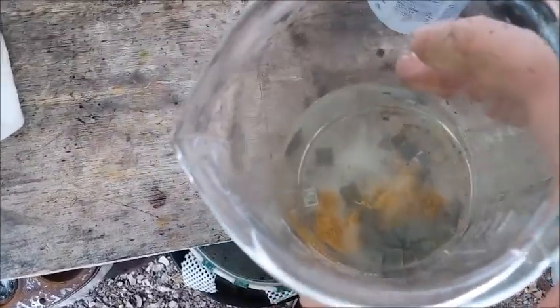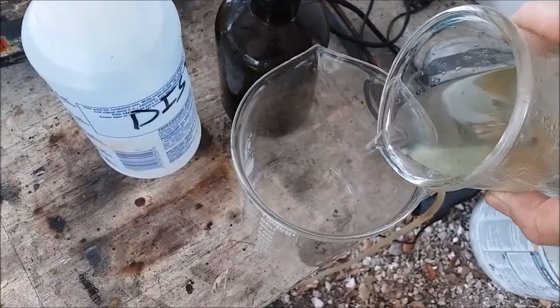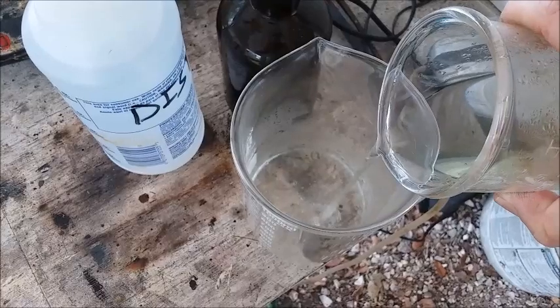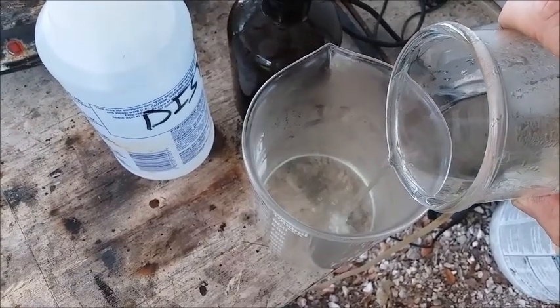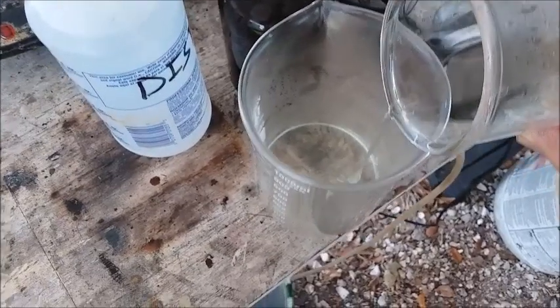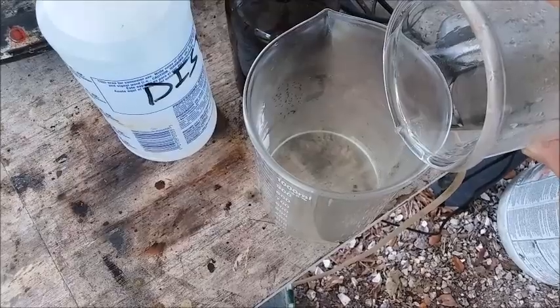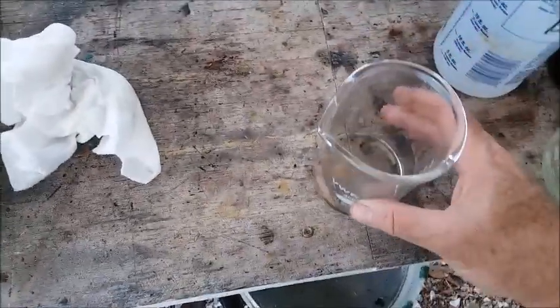What I'm going to do is decant this liquid off carefully so I don't lose gold. I'm going to rinse the contents of the beaker a couple of times with distilled water, and then it'll be time to hit it with aqua regia and dissolve the gold. So, where's my distilled water? Ah, there it is.